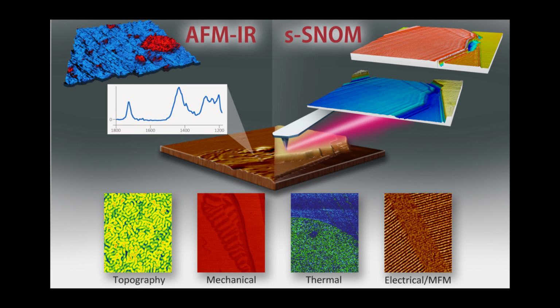So the new source can be tuned over a range. The repetition rate range is not as broad as the QCL, but the range does cover a number of different contact resonances for both the contact style AFMIR probes and the tapping style probes. So it isn't a coarse set in which you have to step. You can actually sweep over some range and match the repetition rate to the contact resonance of the cantilever, giving you the enhancement that allows improved sensitivity.